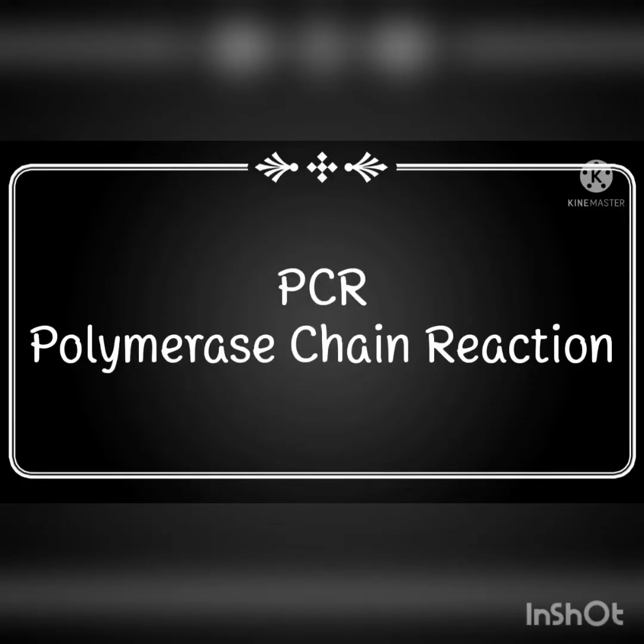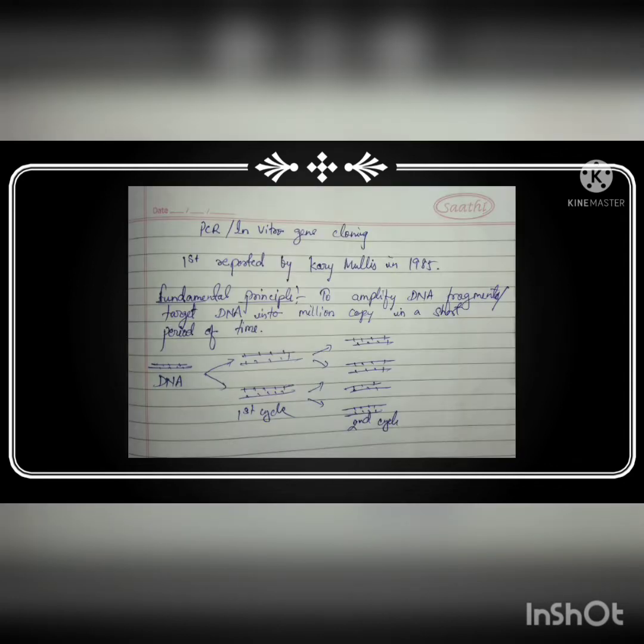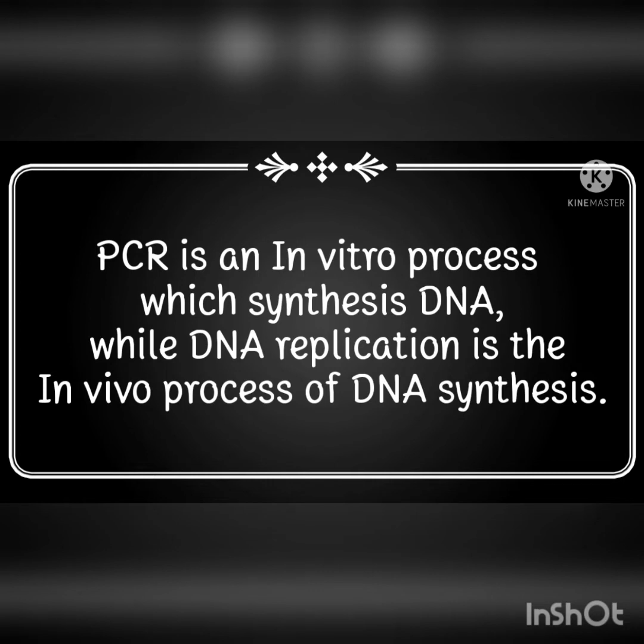PCR. PCR stands for Polymerase Chain Reaction. It was first reported by Mullis in 1985. PCR is an in vitro gene cloning. It is similar to replication.